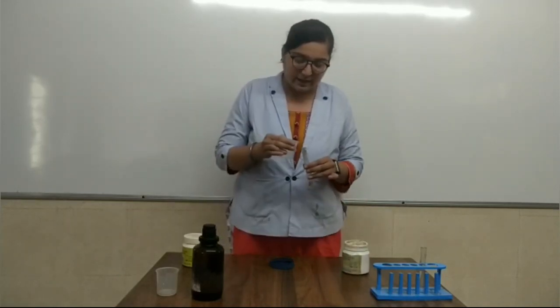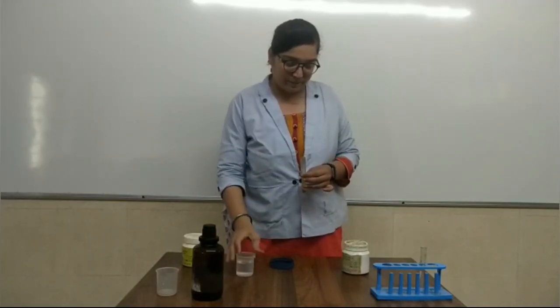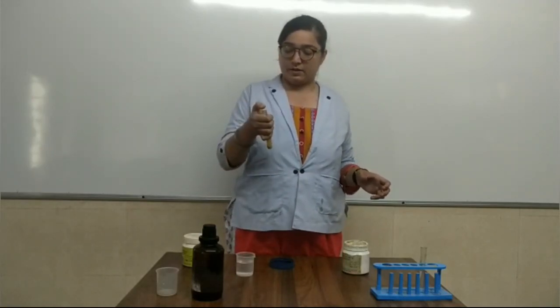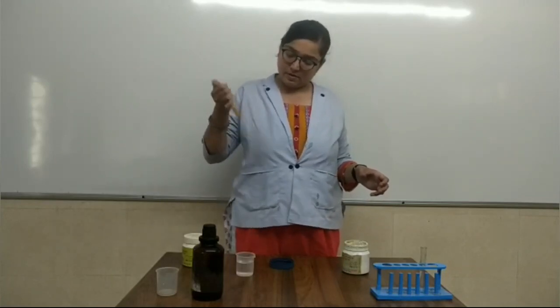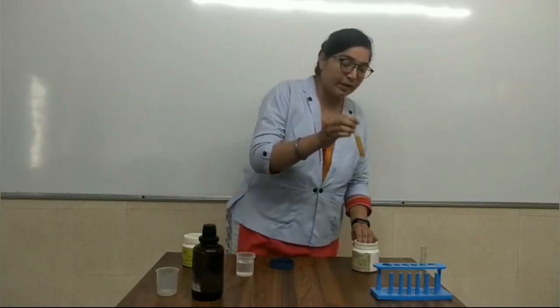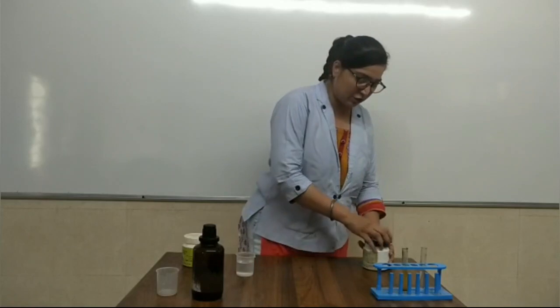Now let us add a little bit of water to it. This is freshly prepared ferrous sulfate solution.